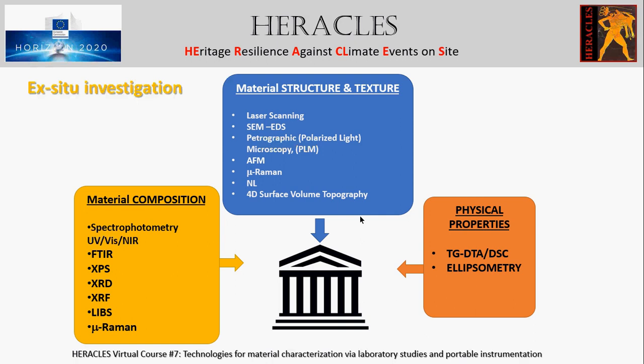Atomic force microscopy is mainly used in surface characterization and can be useful in the studies of aging, conservation, and cleaning effects on material surface for the assessment of behavior of coatings and protective layers, and measurement of the size of aggregates. The sample recuperation is possible.